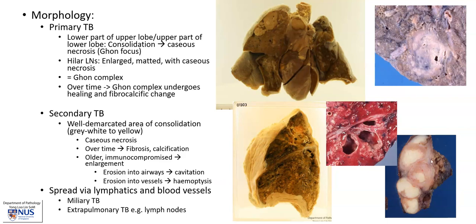Here is a picture showing some enlarged, matted lymph nodes with these geographic, pale, whitish or yellowish areas of caseous necrosis.